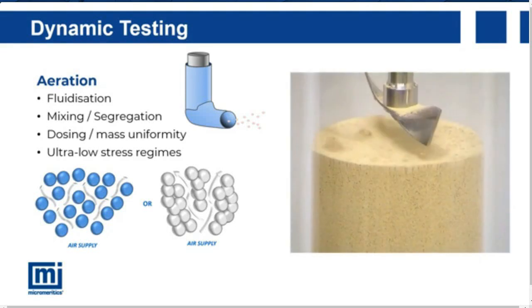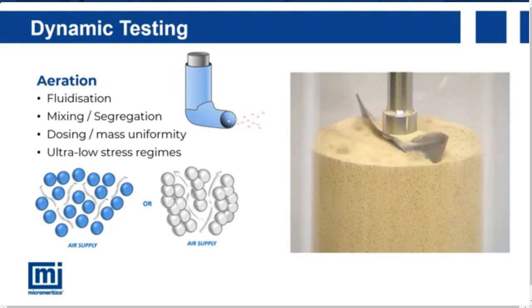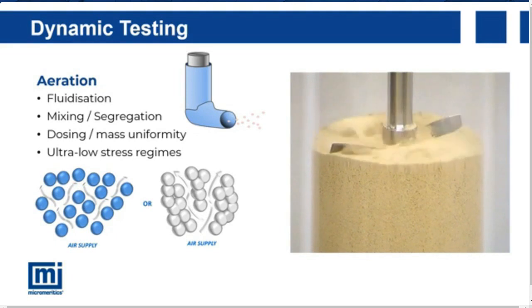This aeration test then is a good measurement of low stress cohesion, and it's important that we draw a distinction between the types of cohesion experienced in these different stress regimes.